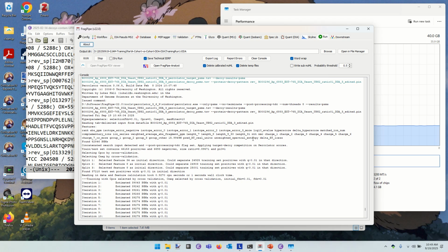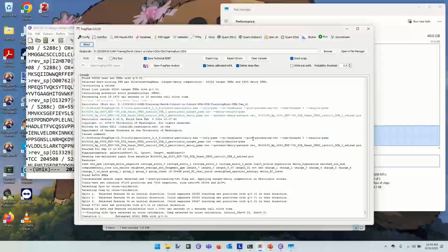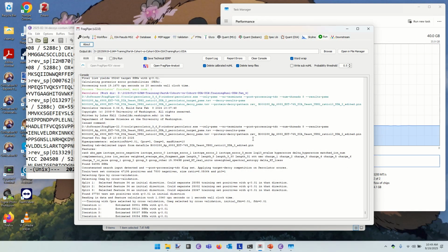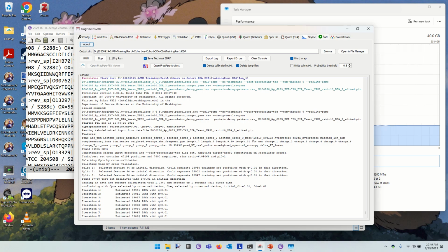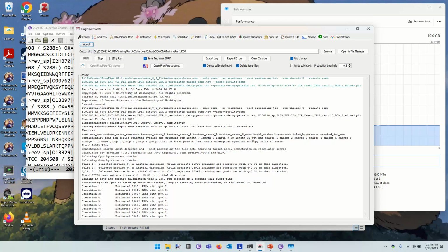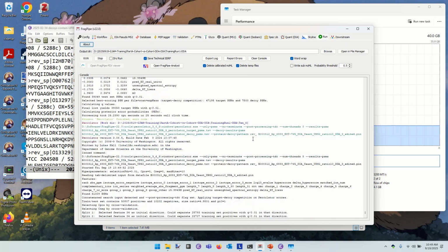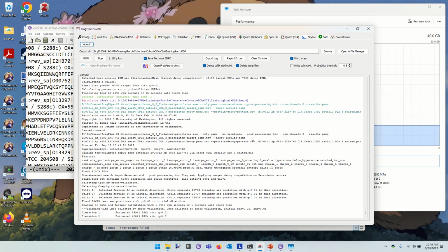I mentioned that this workflow is not going to be limited to just the problem of identifying spectra. It's also got to figure out which of those spectra it actually believes, and that's what it's working on right now. It's using an iterative process to figure out the best way to separate good peptide spectrum matches, that's what PSM stands for, from the unreliable ones. Okay, so Percolator and Philosopher and ProteinProphet are just going to keep rolling by doing their thing.